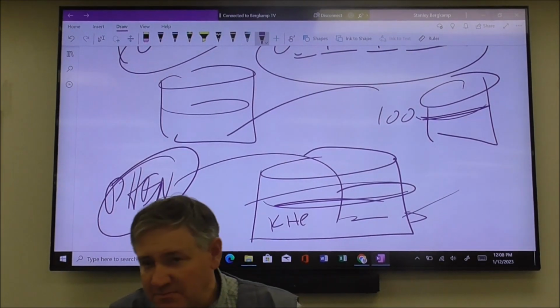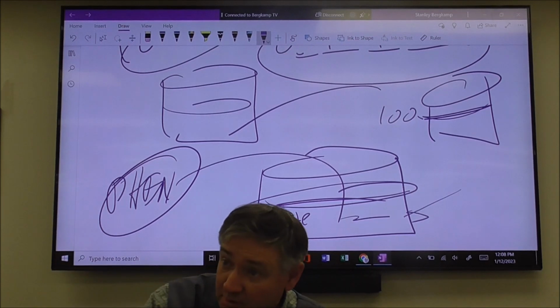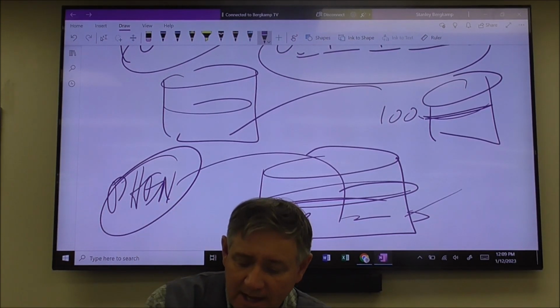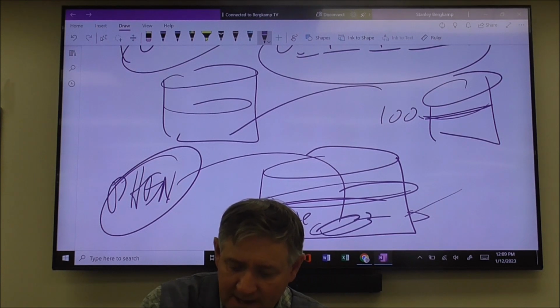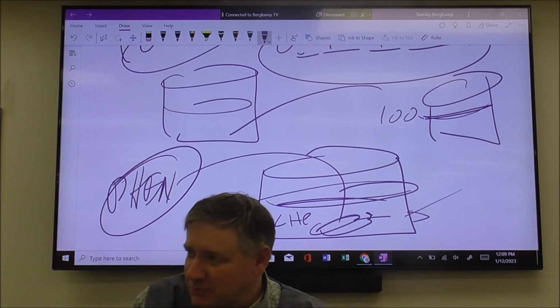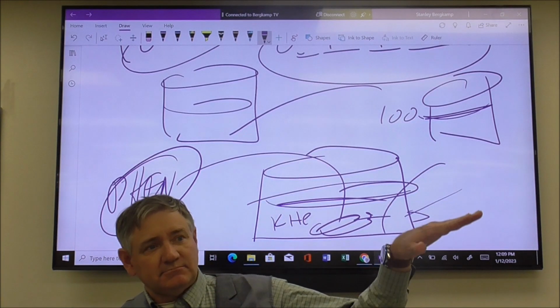We're not going to measure the pH in this one, okay? This has nothing to do with pH. We will tomorrow. Tomorrow we'll worry about pH. We're not worrying about pH today. And so you're going to have your little magnet, and it's going to be stirring around, and you're going to look like little scientists. It's going to be cool, right? And you're going to add your phenolphthalein, and it should be clear, okay?